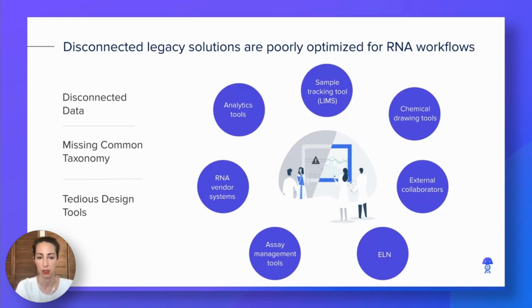As these approaches have gained traction scientifically and clinically, the tools to engineer them have been frustratingly limited, however. Scientists chemically modifying RNA oligos have had to contend with manual, low throughput, and disconnected software and spreadsheets to complete the full workflow of designing, analyzing, and testing these complex biomolecules. To date, there has not been a solution that unifies the biological and chemical nature of RNA therapeutics with seamless collaboration, analysis, and scientific insights.